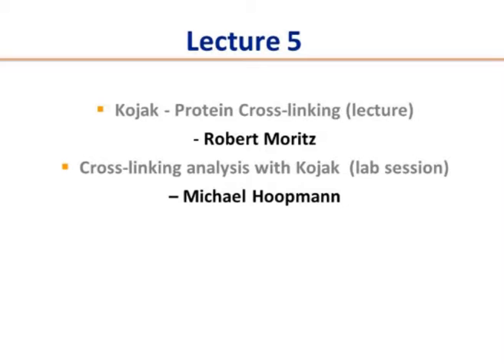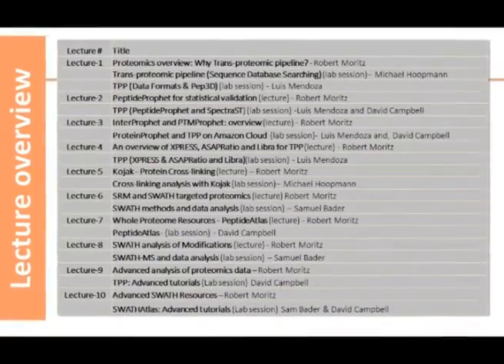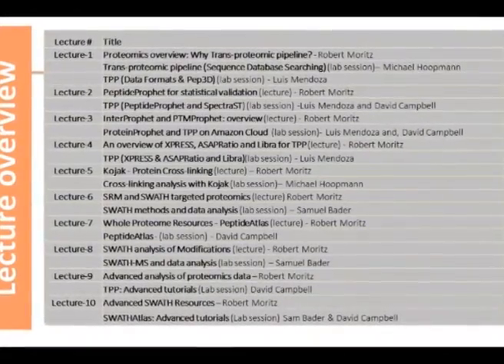You can also download those and incorporate into your bioinformatic efforts. And then we'll also talk about some resources as we go through. But this morning we have two components. One is the St. Peter, which we spoke about yesterday, and also Kojak.